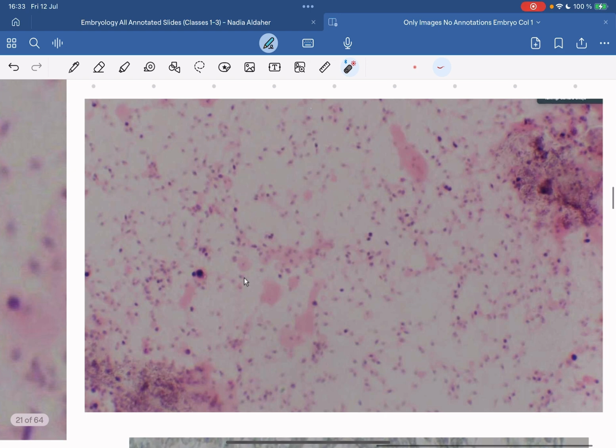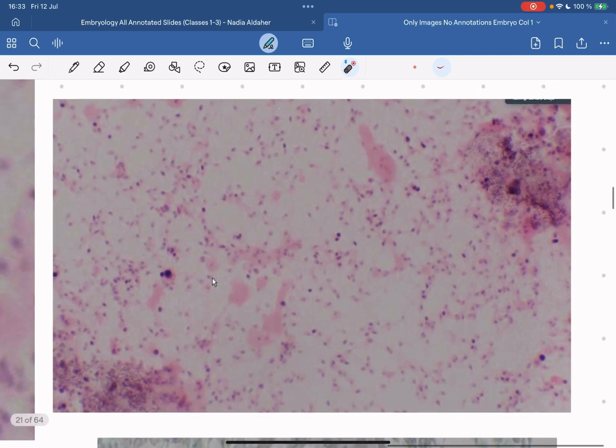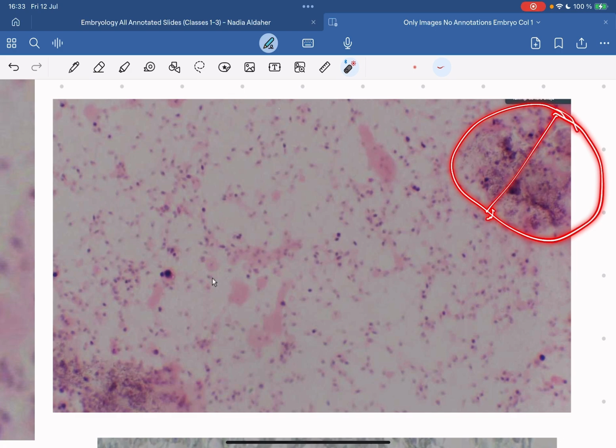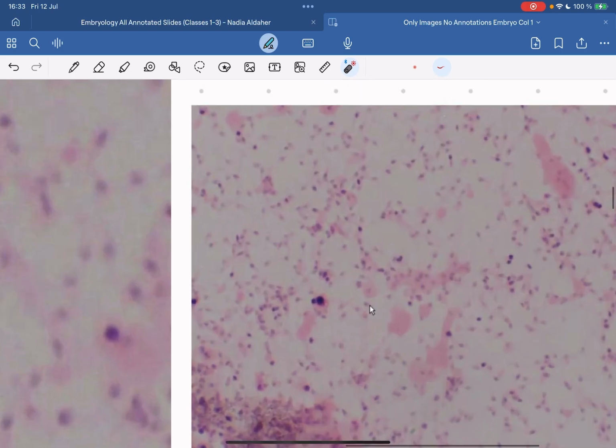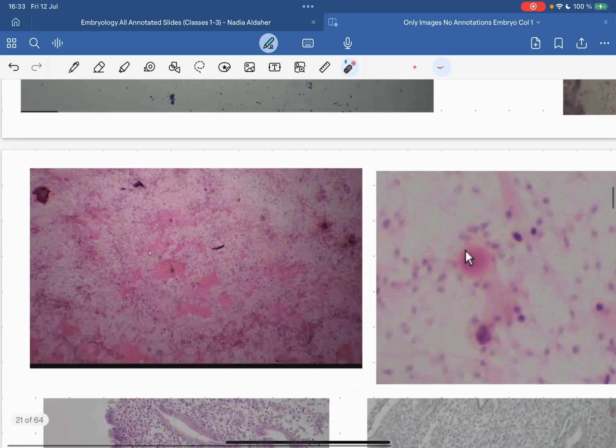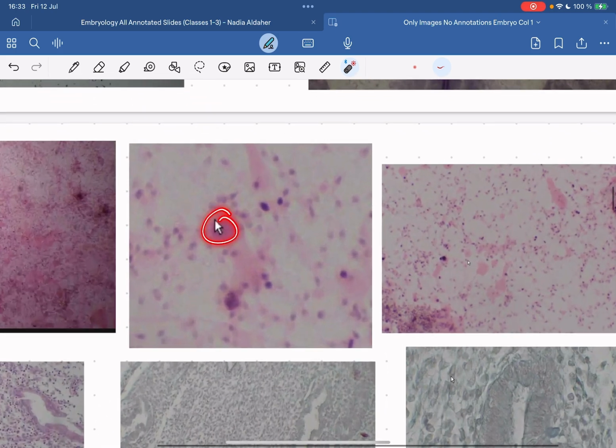Here we can see it as well. This would be the lymphocyte. We don't really see a urethral epithelial cell here, but here we can see the conglomeration of spermatozoa because they're bunched together like this. Okay, so if you see anything that looks like this, you'll know that you're in human sperm, specifically if they ask you about those classic cells.